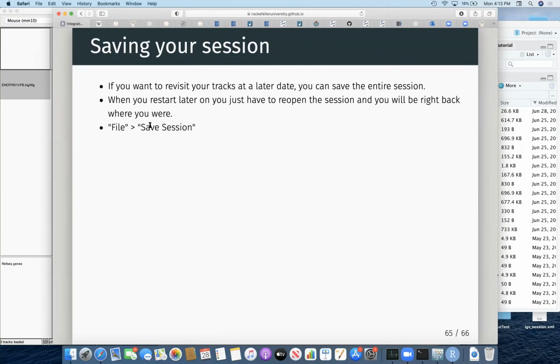So I know a lot of people use IGV for their final publication image. They just need to take it into something like Inkscape first to allow you to do a little bit of tidying up.